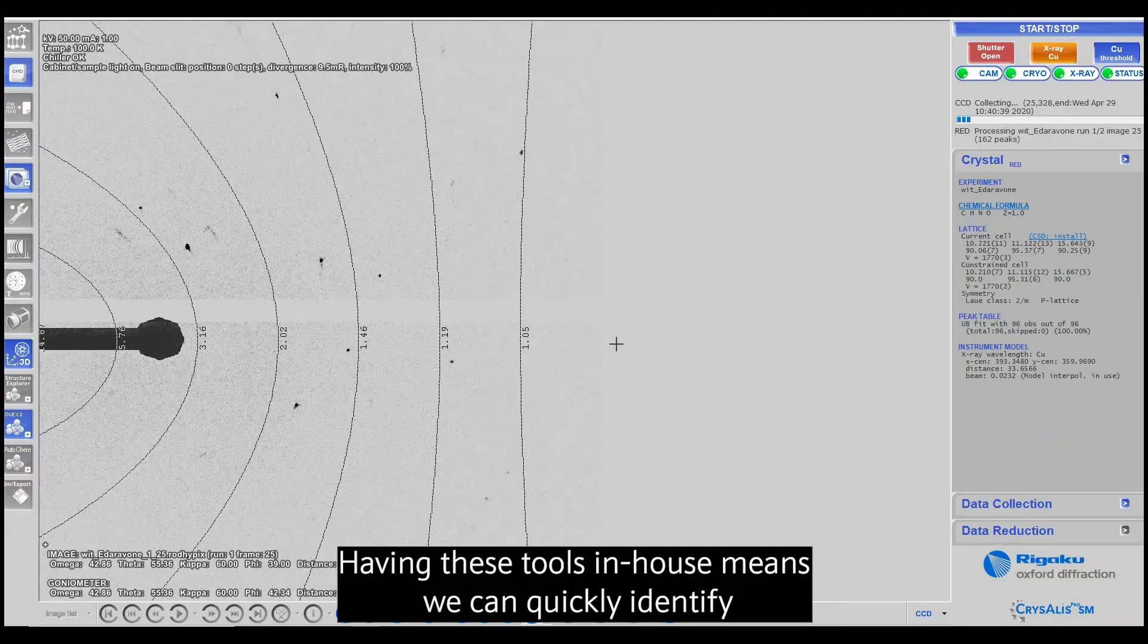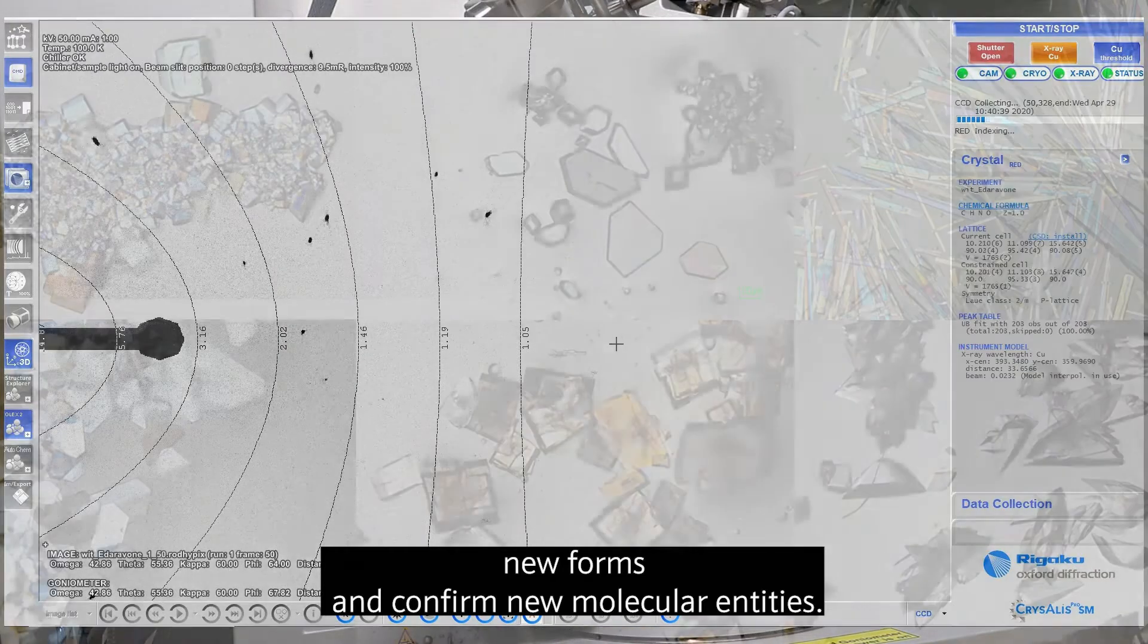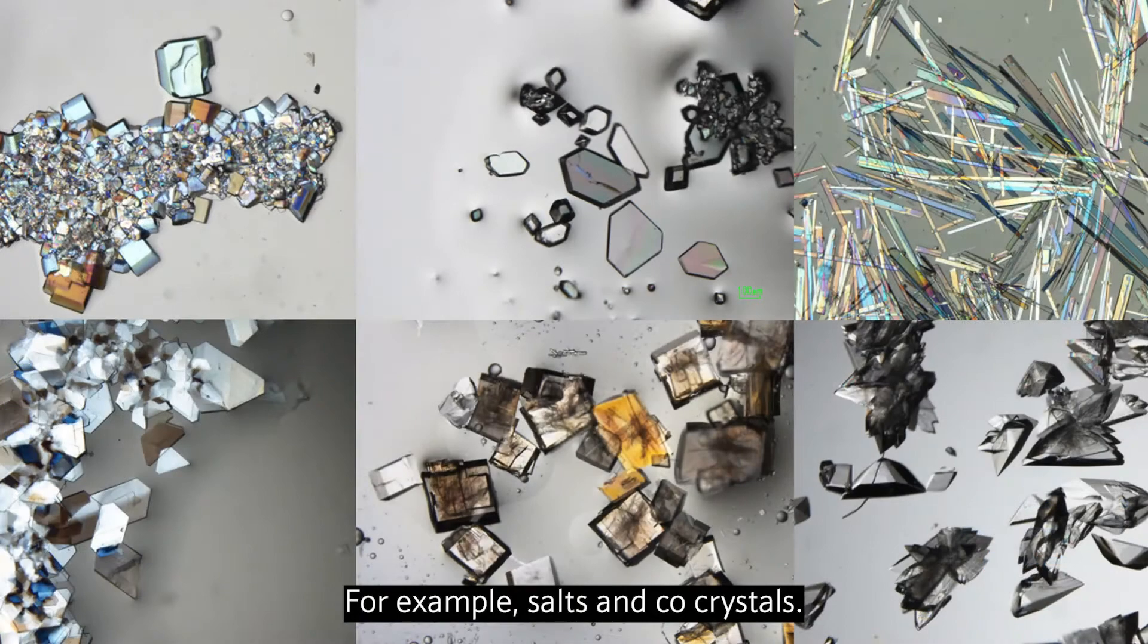Having these tools in-house means we can quickly identify new forms and confirm new molecular entities, for example salts and co-crystals.